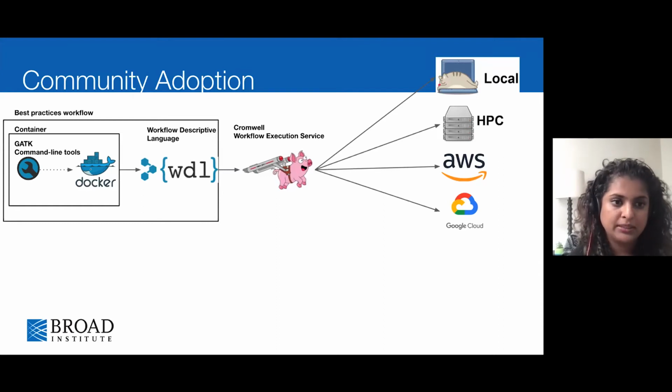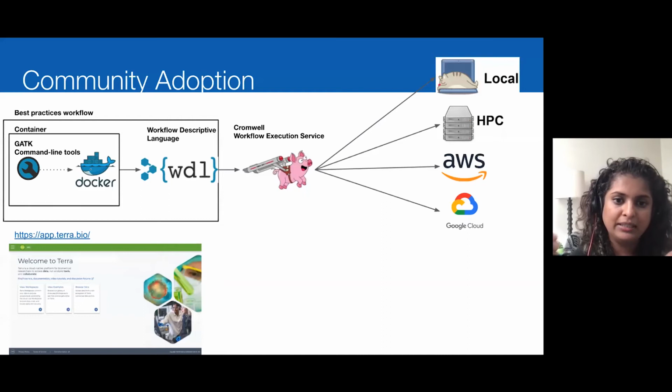For that purpose, we have written all of our tools in a workflow description language called WDL, which makes these workflows platform agnostic. We've also provided these WDL workflows in Terra, our cloud-native platform that enables collaboration.